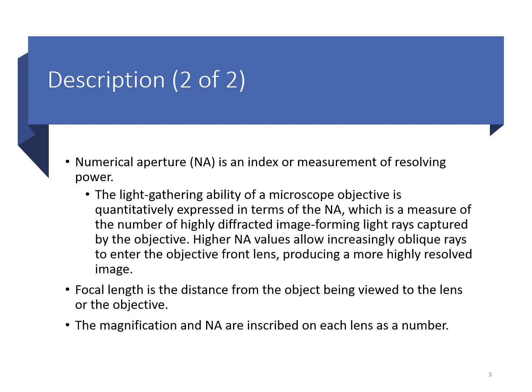It also has a little bit to do with the distance that the slide is from the actual objective or lens. So these things combined will determine the amount of resolution that you have on a slide.